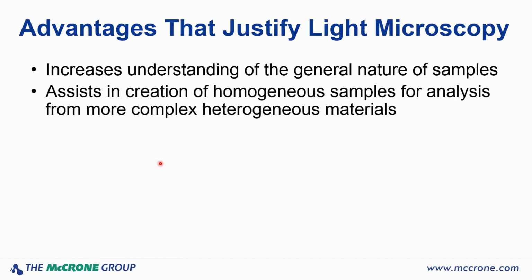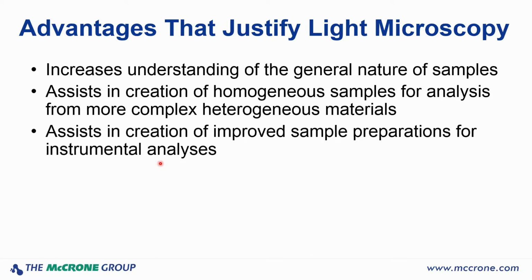We can create homogeneous samples from heterogeneous materials. I've shown you one technique. There's multiple techniques. Another one I did not have time to show you is using a solvent to extract a soluble material out of a particle. An example might be plasticizers from plastics. But anyhow, we can create those homogeneous samples and it makes it much, much better for our interpretation. We're not trying to have multiple samples mixed together that we're trying to make sense out of.